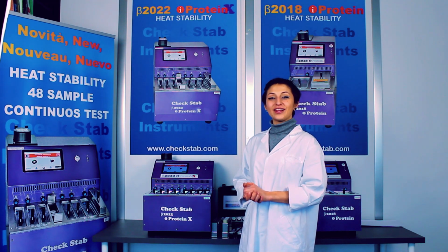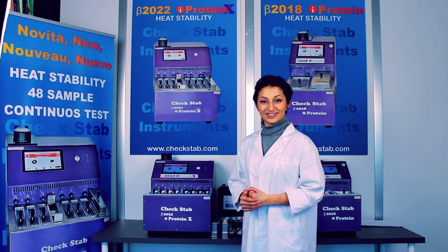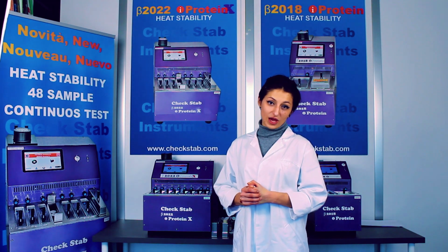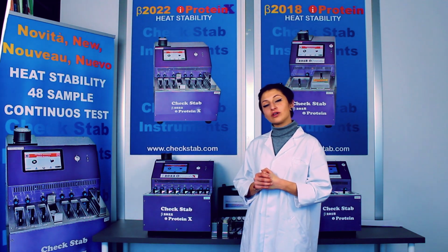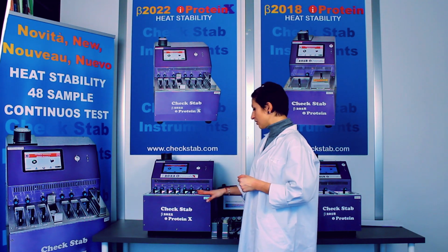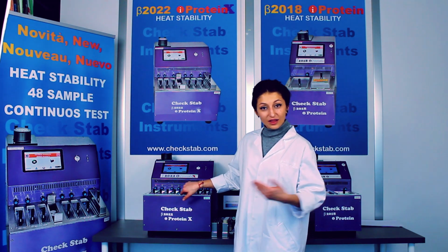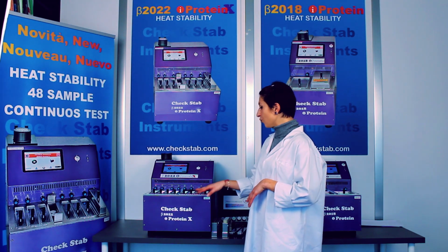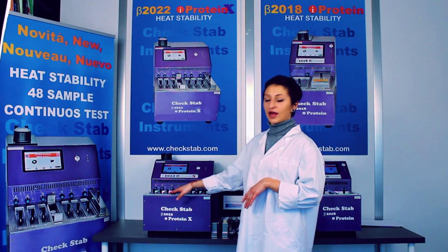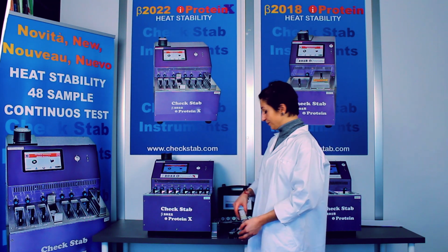Also, we are here with the latest instrument on the market, the Beta 2022 iProtein X. iProtein X was born to perform the heat test in a continuous way to meet the needs of laboratories that can receive samples at different times of the day. This instrument gives the possibility to insert the sample at any time without waiting for the end of the cycles. We have 24 samples per thermostatic bath divided in racks that can contain 6 samples each.